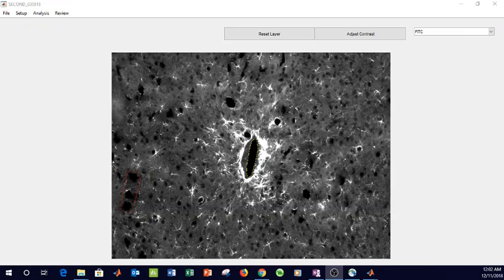All right, so this video should be pretty short. We're going to show you, after you've set up all of your images, with the annotations and saving your config files, how to then go through and analyze them. This is going to calculate the expanding concentric rings around the whole mean intensity for each ring. So let's go up to analysis and batch run.